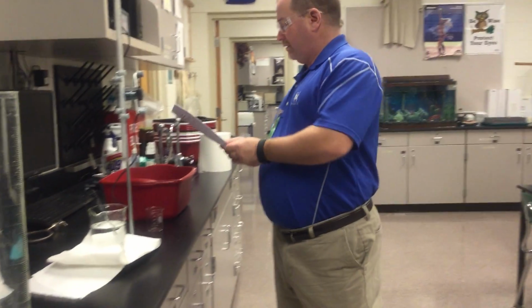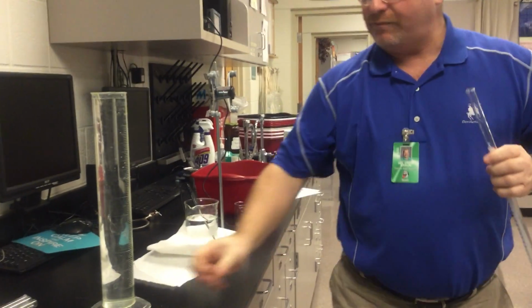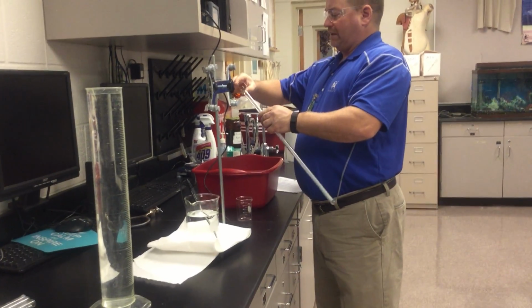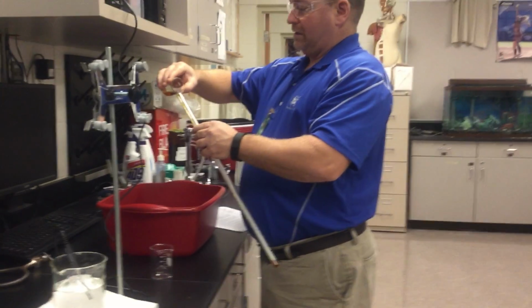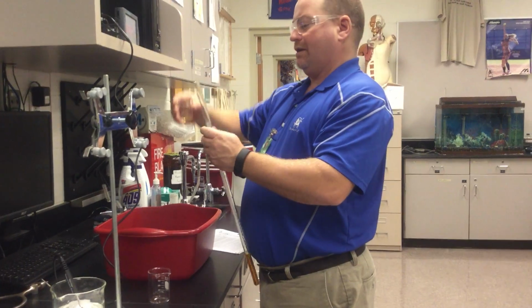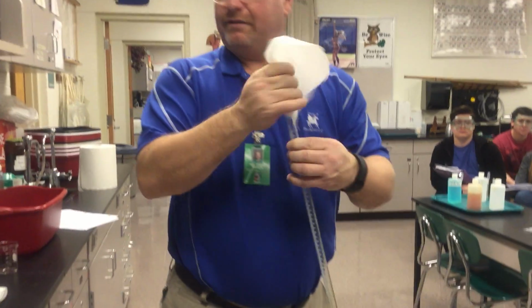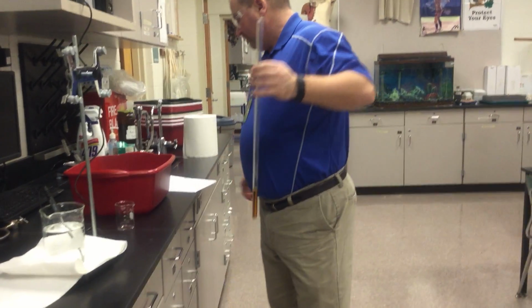It says to carefully pour into the eudiometer. So, here's my eudiometer. I'm going to carefully pour my 10 milliliters into my eudiometer. Now, what you're going to see, ladies and gentlemen, is that this is pretty good, having this color in here, and I'll show you why in a bit. Okay, so I just added this.